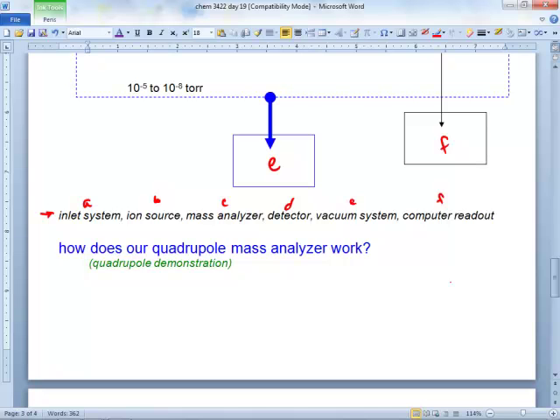Okay. Would this be shooting through the inlet system? No. It's not separated. Right? So this is what would shoot through the GC inlet or the LC inlet, right? Okay, so she wants to be the inlet system, so she better just take what out of here? Yeah, just pick a pure thing here.